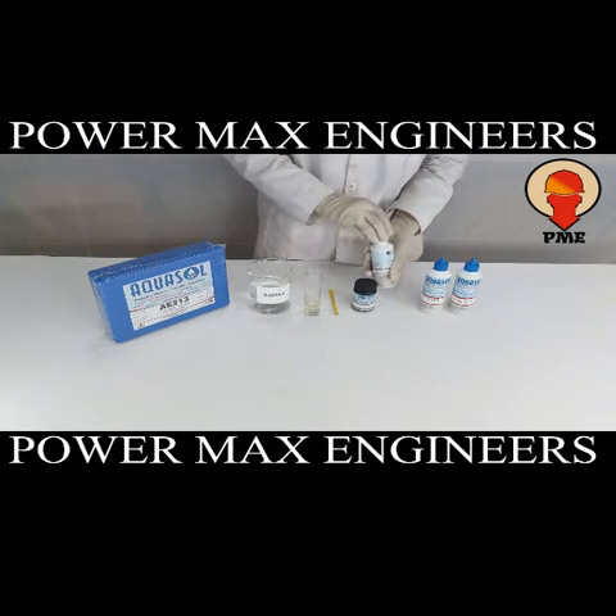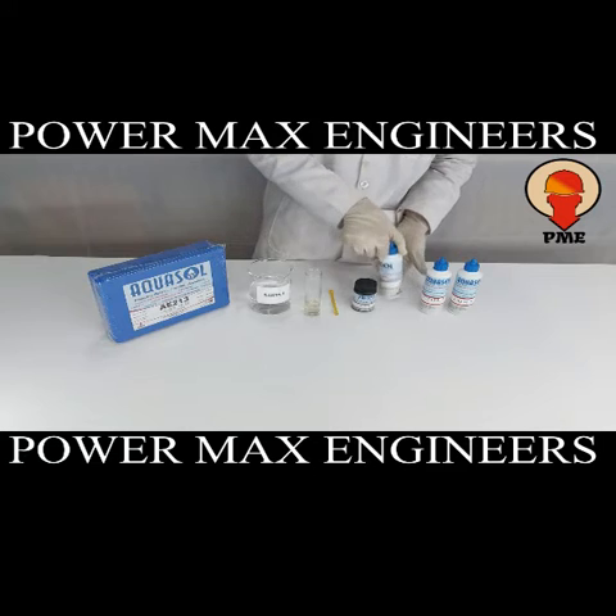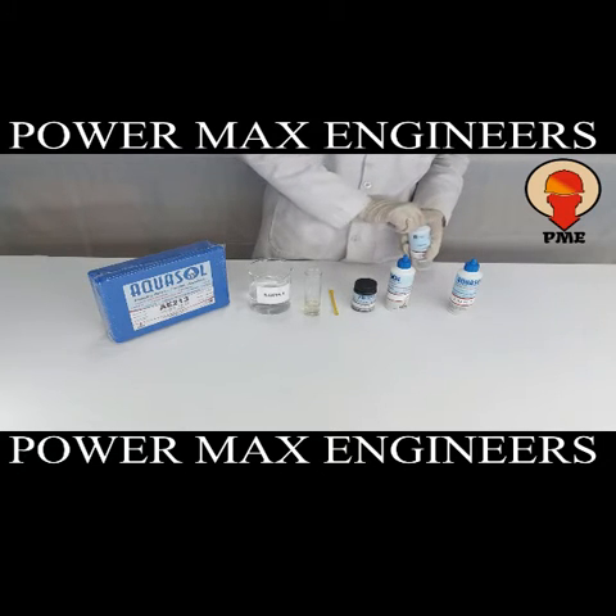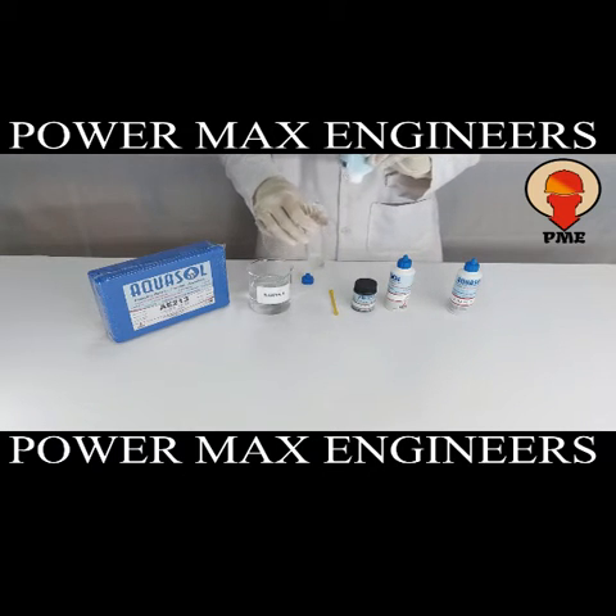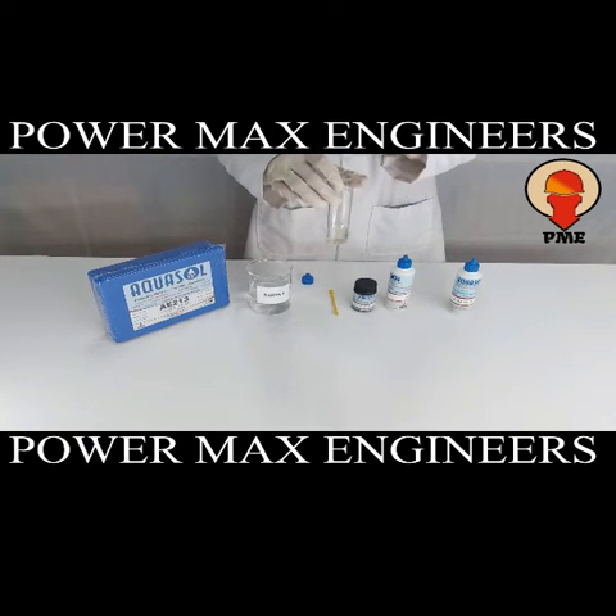To estimate the value of chloride, we will add CD3L2 drop wise. Count the number of drops while mixing until the color changes from yellow to violet.